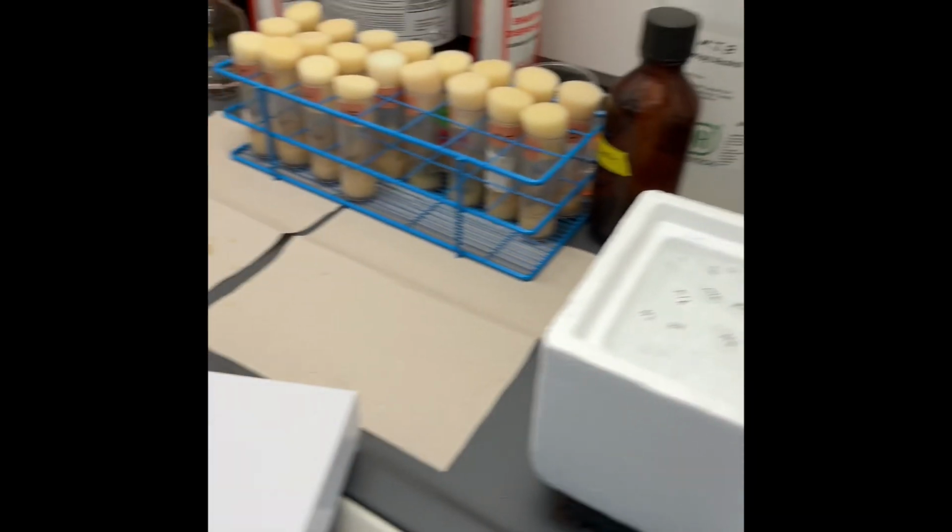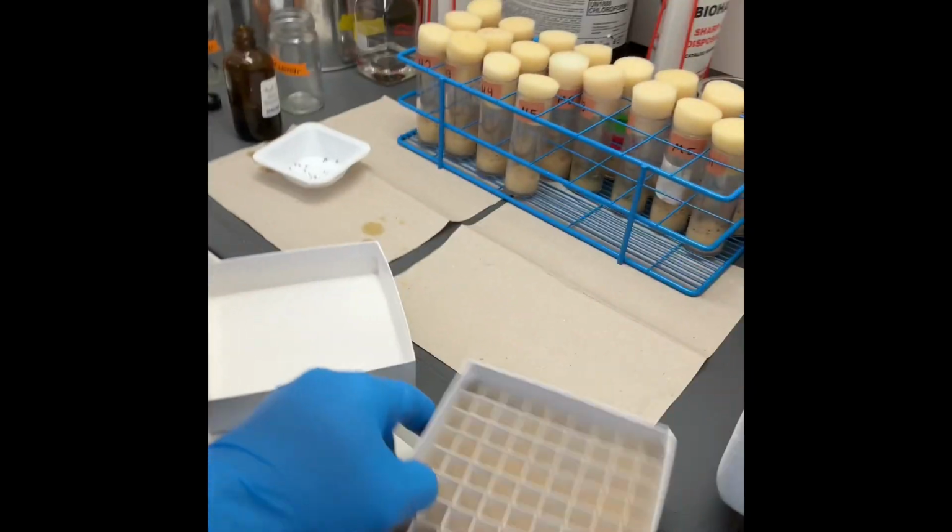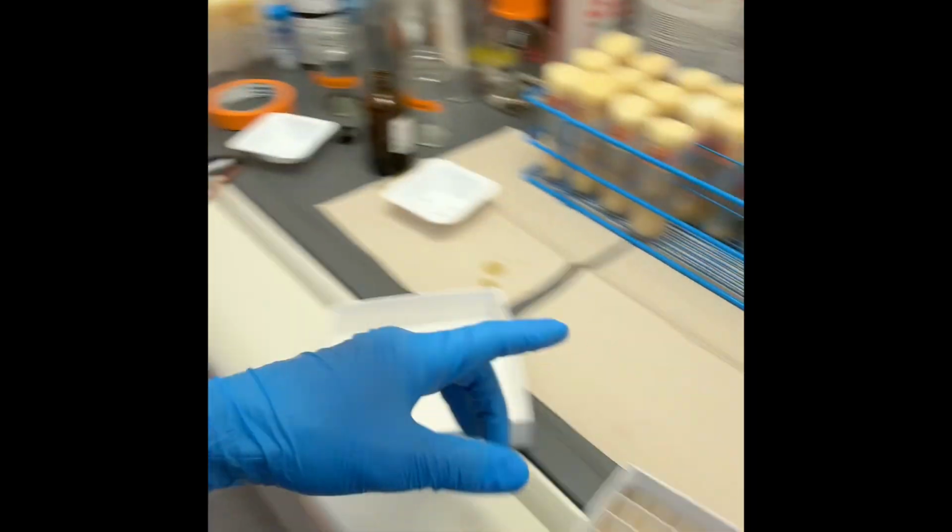So next, I'm putting the flies, which are being frozen there, or chilled, into here. From here, I'll be putting them in the negative 80 degrees Celsius freezer so that we can obviously freeze them and then extract their RNA soon, or their DNA, make it into RNA. So it's gonna be awesome.